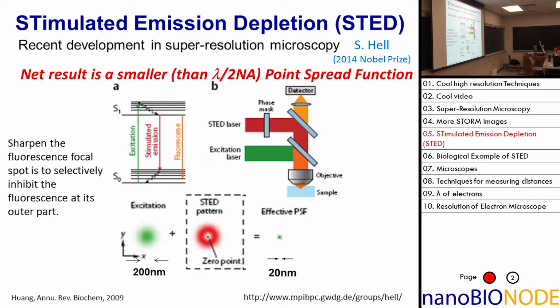You collect your fluorescence, there's a certain width, again, it's like a mountain, a certain width, but if you have enough photons, you can get it to 250 divided by the square root of N. This is well known. So that's one way of determining where the center is.